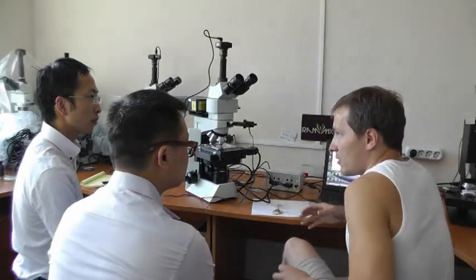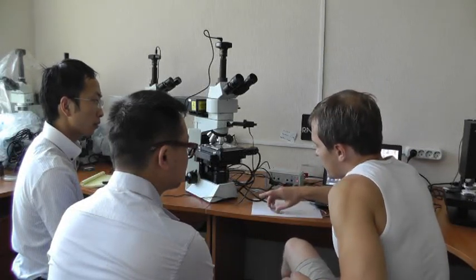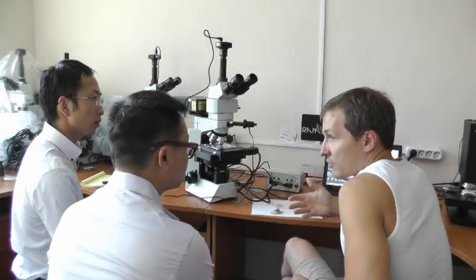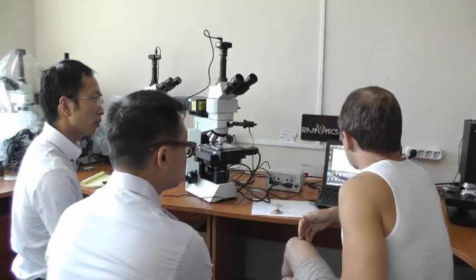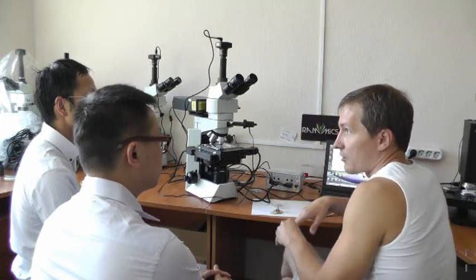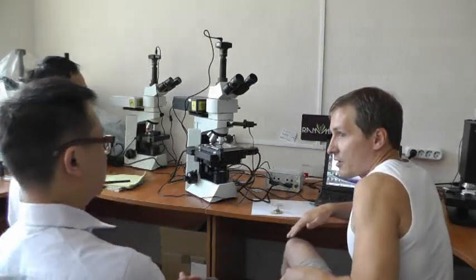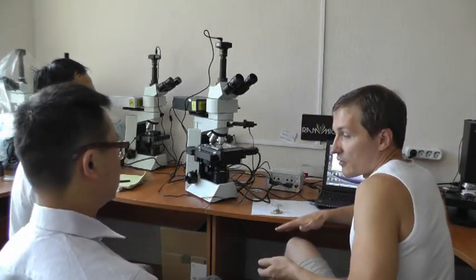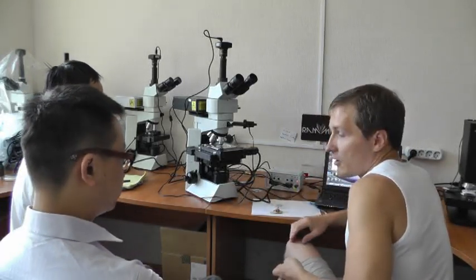They will always be superimposed. Also, a metallic surface was chosen because it reflects the Raman signal and doubles the signal output of our measurement. Imagine you have Raman signal passing in all directions, upwards and downwards, and in the case of a glass surface we just lose half of the signal. If I use metal foil, it will reflect everything.